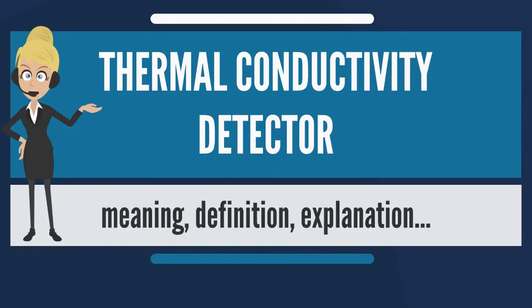Catharometers are used medically in lung function testing equipment and in gas chromatography. The results are slower to obtain compared to a mass spectrometer, but the device is inexpensive and has good accuracy when the gases in question are known, and it is only the proportion that must be determined.